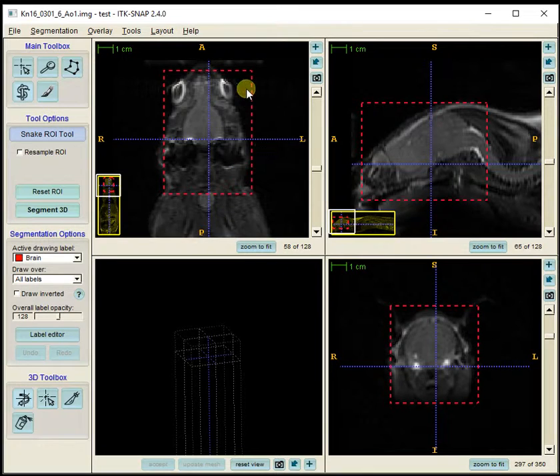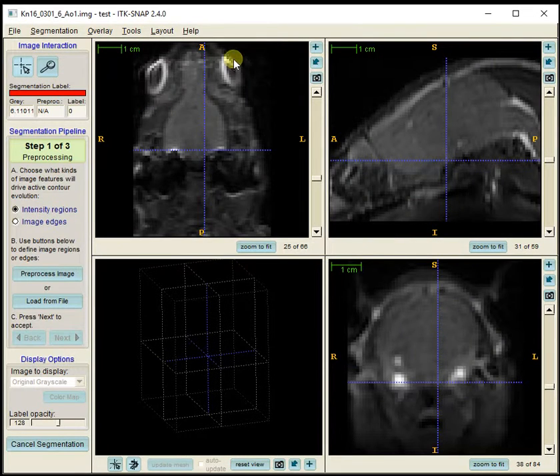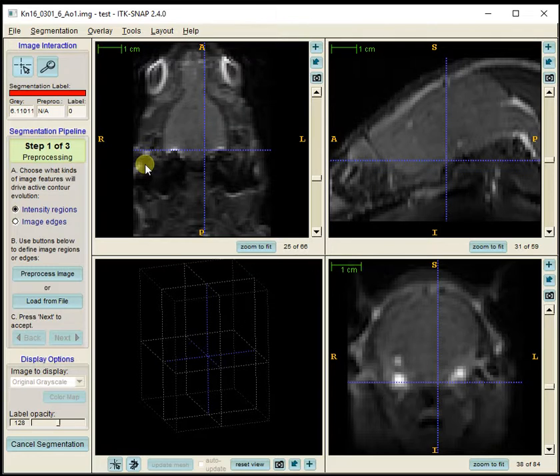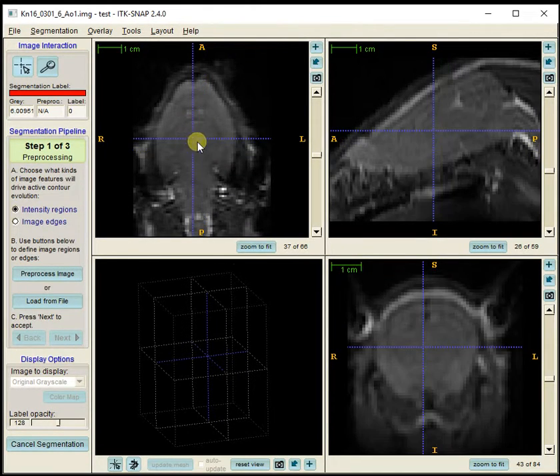Once I'm happy with this red box, I press the Segment 3D button. That takes away all the other pixels from the image so that I can focus on segmenting the brain — just the particular region I'm interested in.